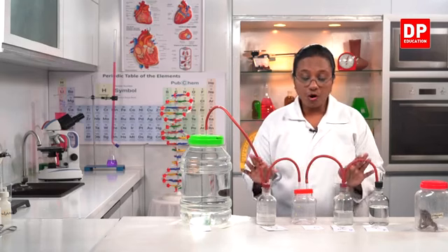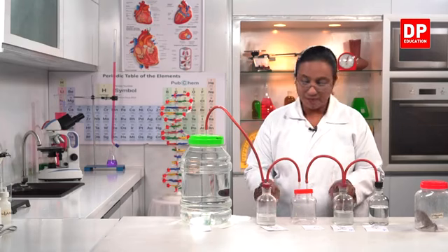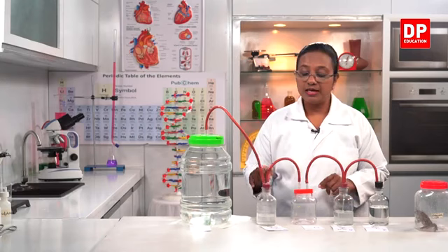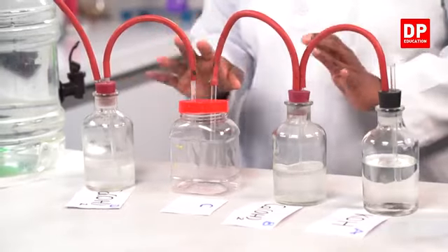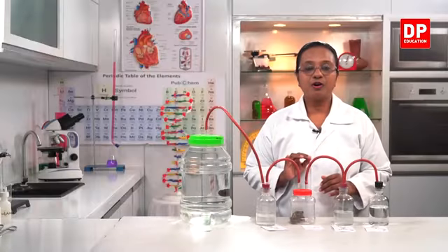So you all have to observe these 2 bottles carefully. Now you all can see both of them, they are colorless solutions. Lime water in bottle B and lime water in bottle D, both are colorless solutions. Once we have the frog here, you will see a difference. That is what you have to observe clearly. Okay, students. So now I have the frog also in place.